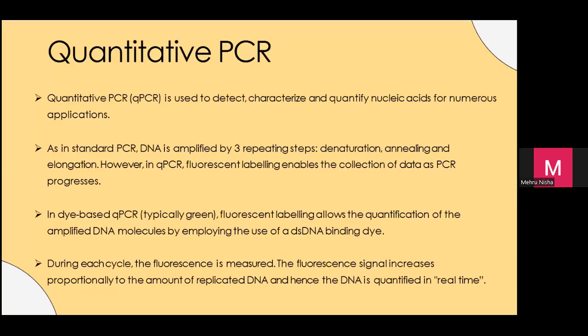Okay. One more thing is quantitative PCR. Quantitative PCR atau kita panggil real-time PCR atau qPCR, which is very widely used now during the COVID time. This one is used to detect, characterize, and quantify nucleic acid for numerous applications.